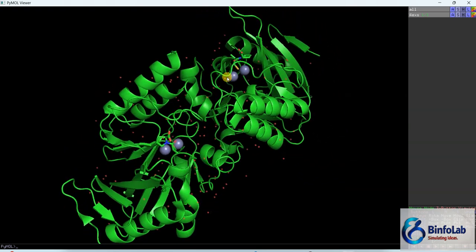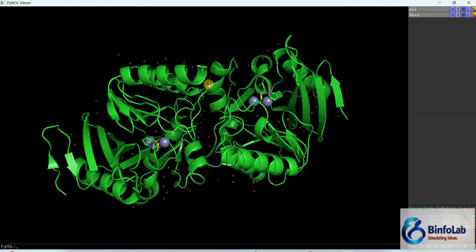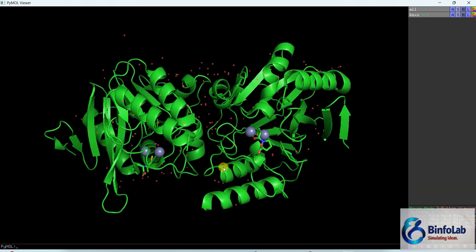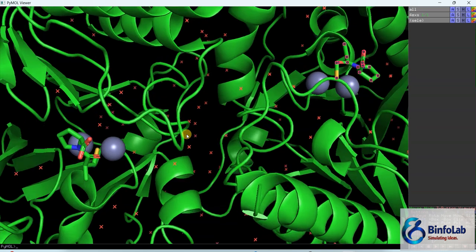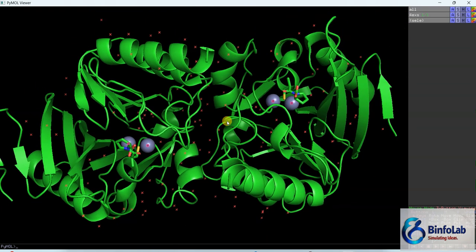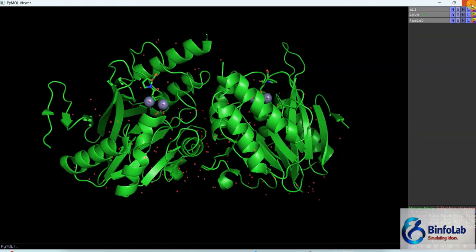You assume that it contains two different proteins. This is point one, because I will also teach you protein-protein interaction with LigPlot. Okay, each protein, or each chain, contains the ligand. This is your ligand, and for this chain, this is the ligand. Each protein also contains two zinc ions here and two zinc ions here. So this is basically our protein. So let's close it for now.